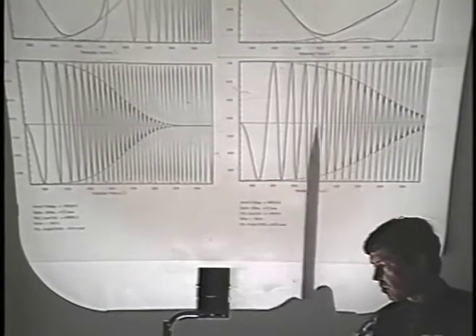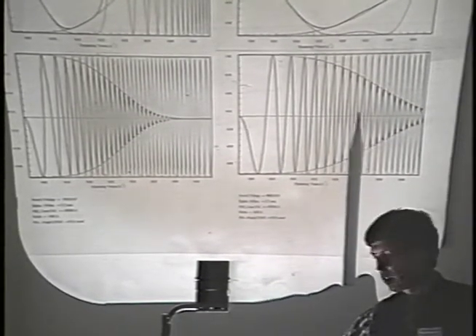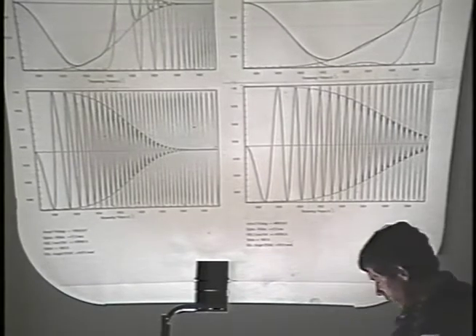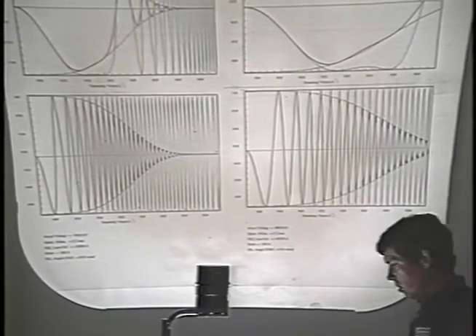And so even with the higher defocus values, we can actually extend the resolution to much higher values with the 400 kV. Now, the second item on the list here was the coherence envelope functions.